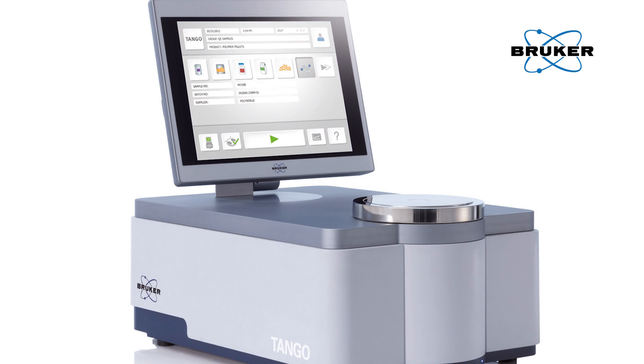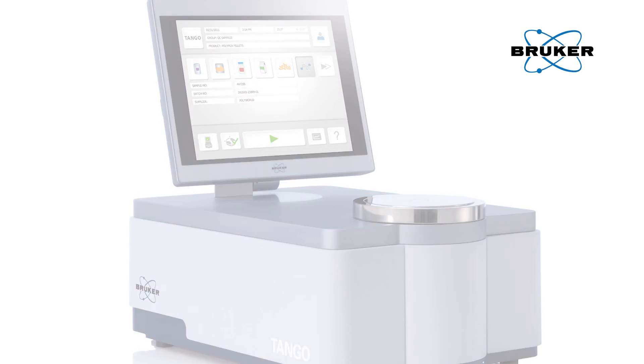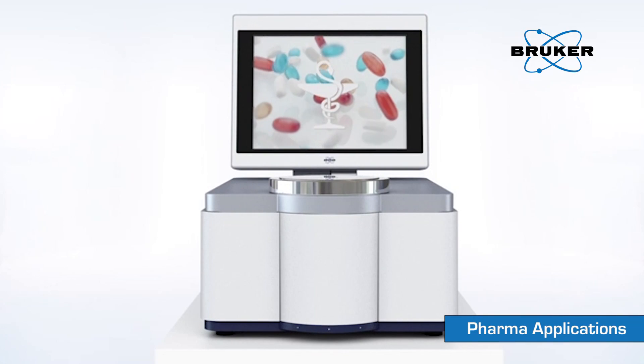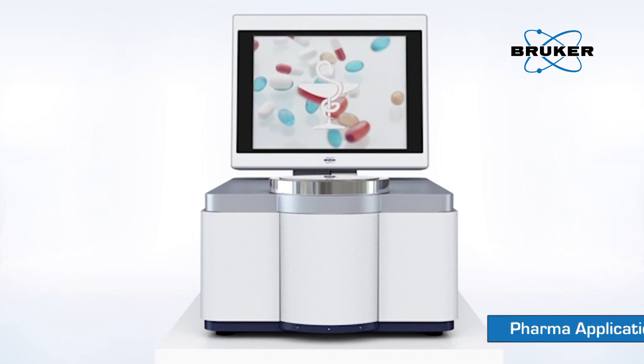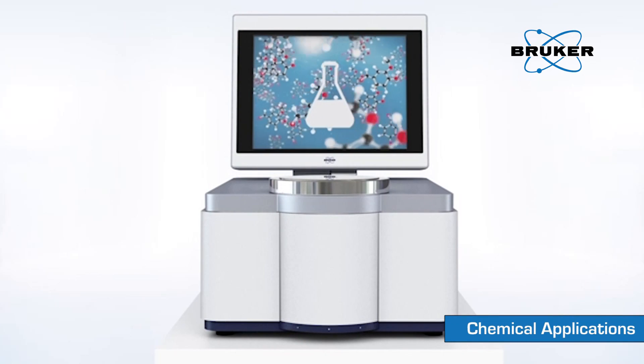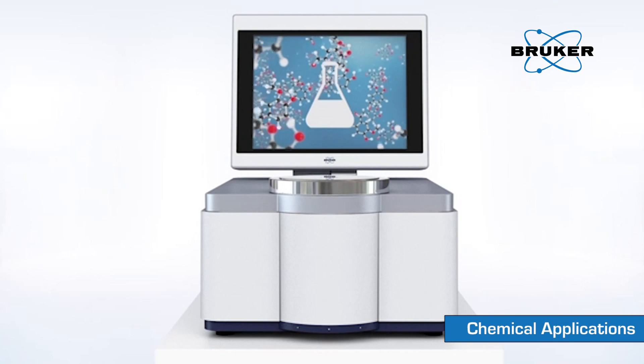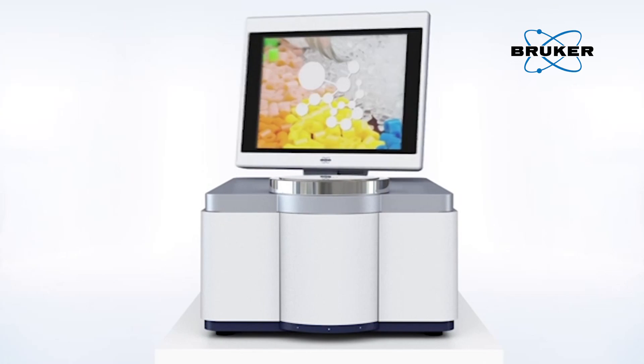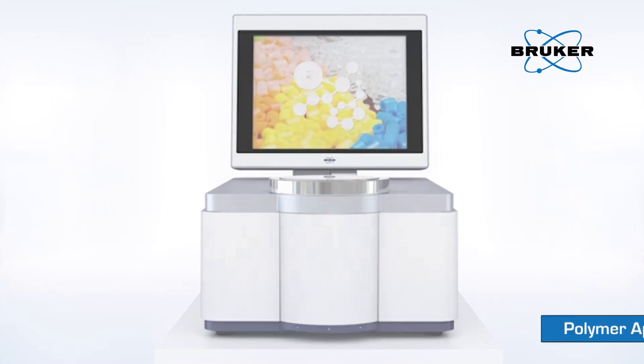Tango offers an efficient and cost-effective analysis for material identification and quantification in a wide variety of application fields. The comprehensive application support of the Bruker specialists helps to select the optimal measuring method, as well as appropriate accessories and software solutions.